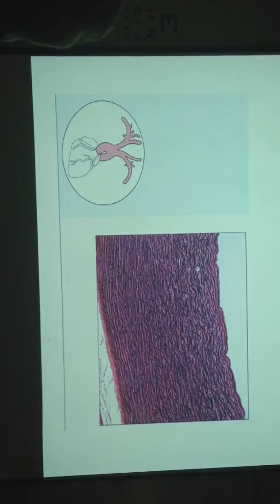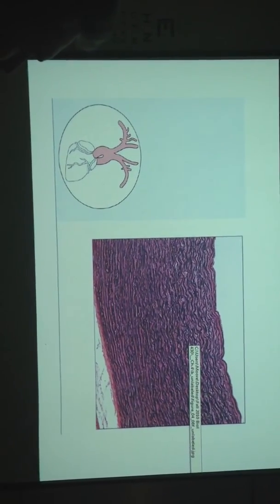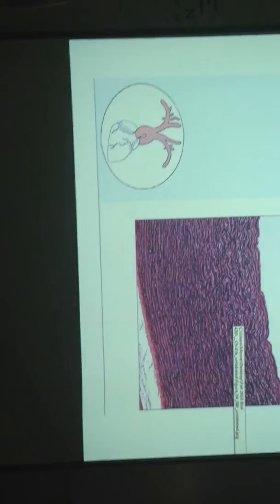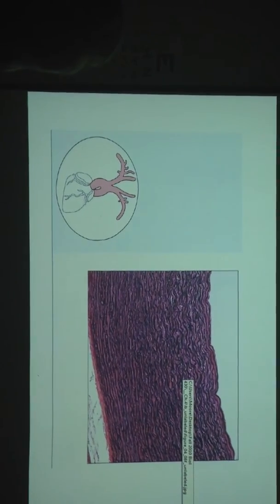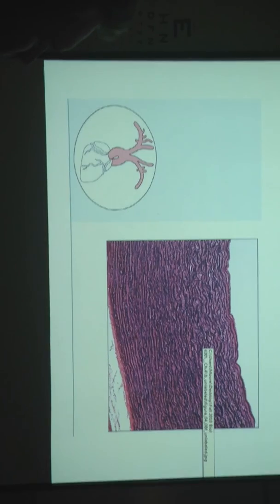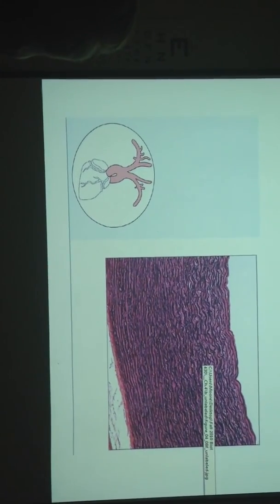And these black bands aren't individual elastic fibers, they're bundles, or really sheets. You can't tell from this view, but it's a sheet of elastic fibers, so they're called elastic laminae. Location found: big arteries, walls of large blood vessels like the aorta, and some spinal ligaments.